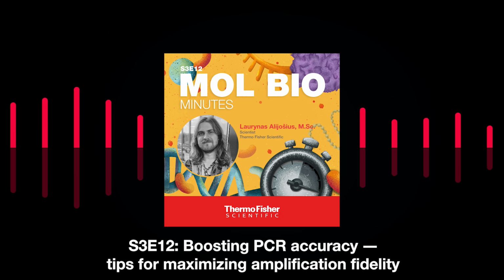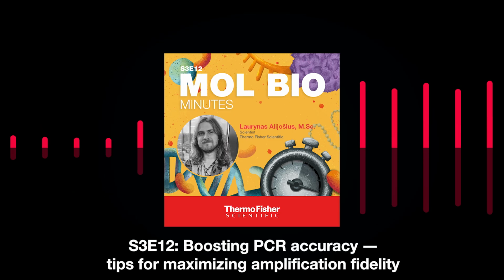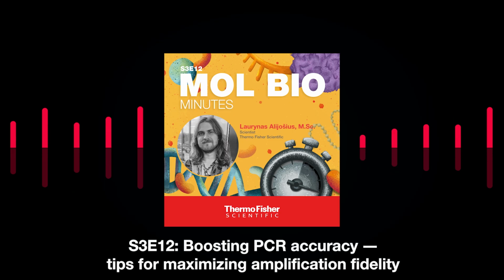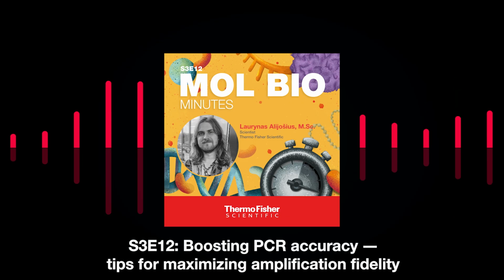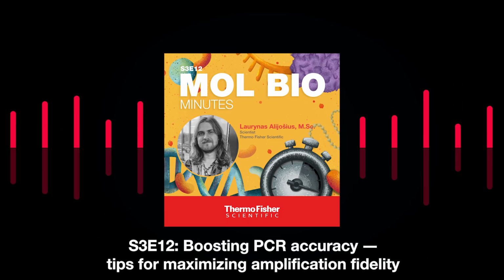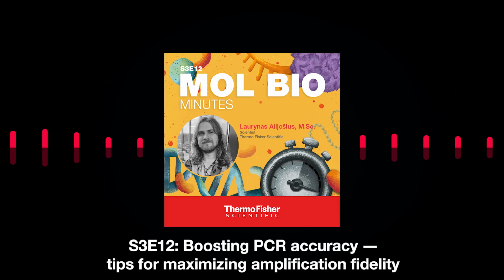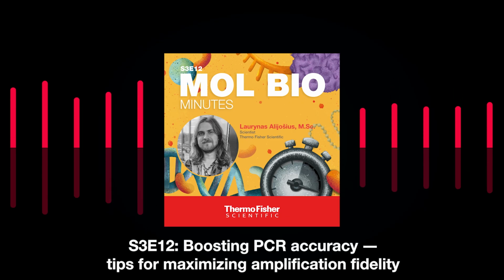For example, let's take nucleotides. Nucleotides are like bricks or building blocks for the newly synthesized DNA strand. So if your bricks are of lower quality, then your house will be of not so good quality too, right? The same goes for the PCR, and the accuracy and the quality of your PCR product could also be compromised a bit here. Other components, such as ions, let's say magnesium ions.